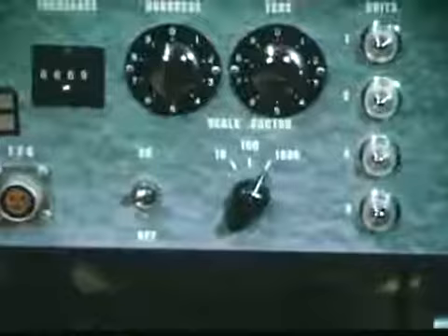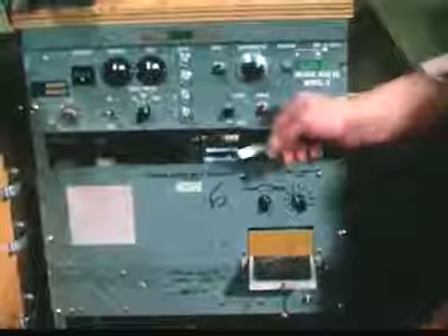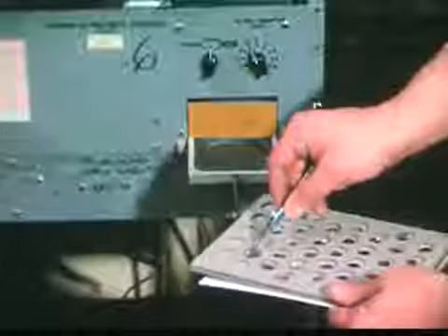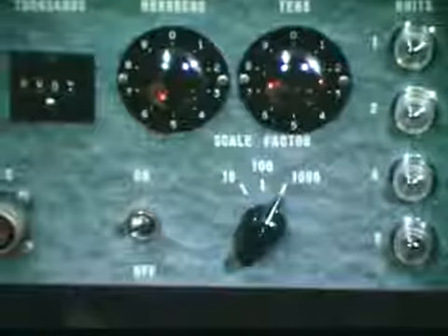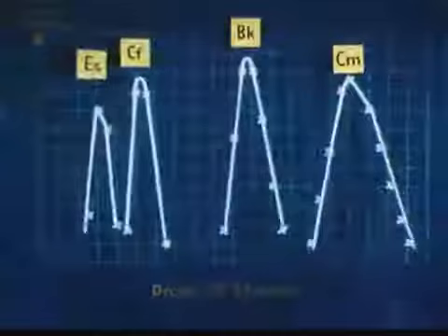This radioassay machine will detect both alpha and beta radiation. So even if only one radioactive atom on this disk decays, the energy release may be detected. We'll insert the disk that caught the first drop from the column. The elements we're seeking have short half-lives, so one minute is sufficient to detect any decay activity. A full minute has passed and we've had no indication of alpha particles. We'll test for beta decay, then continue testing each disk in the order of the drops that came off the column. The data we've collected can now be plotted on a graph showing the number of atoms that decayed in one minute in each drop of the eluent.